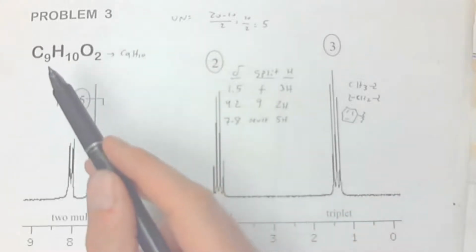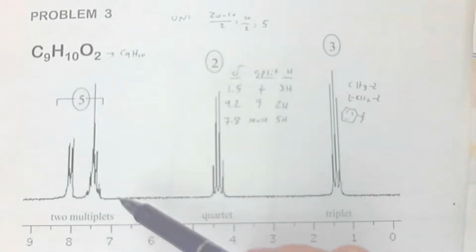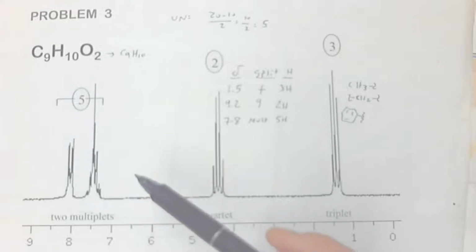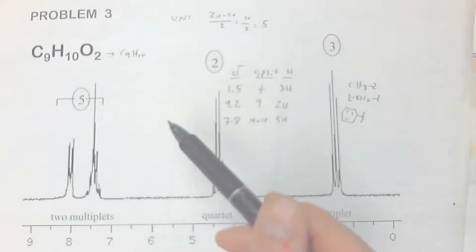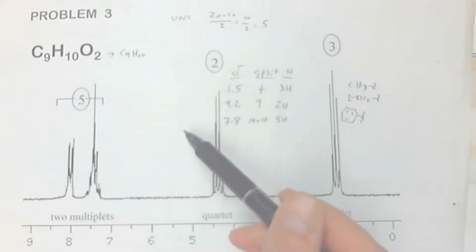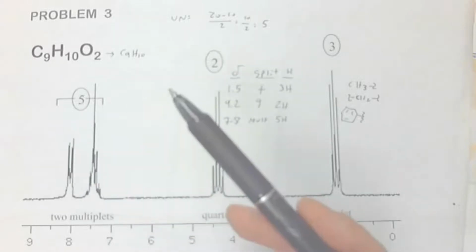What do we do now? We have a carbon and 2 oxygens. Go into your little toolkit of functional groups and you say, carboxylic acid. Somebody said carboxylic acid, and that's a great guess, and it is wrong. But it's good you're thinking carbon, 2 oxygens, carboxylic acid, right?